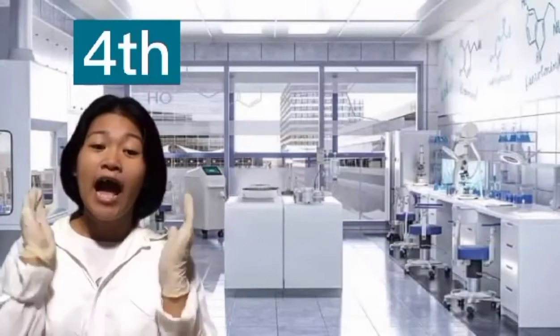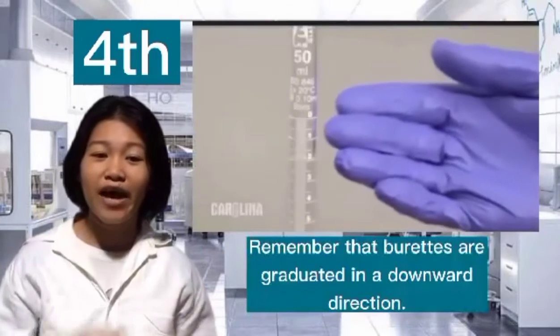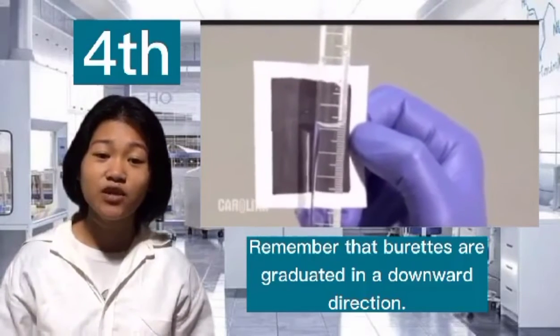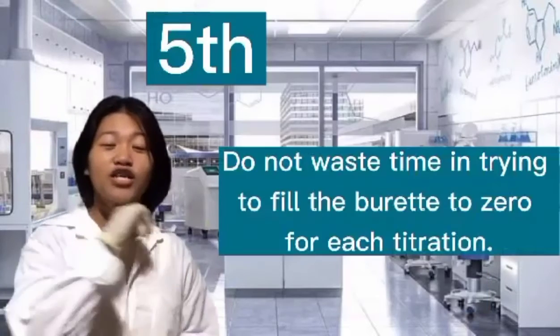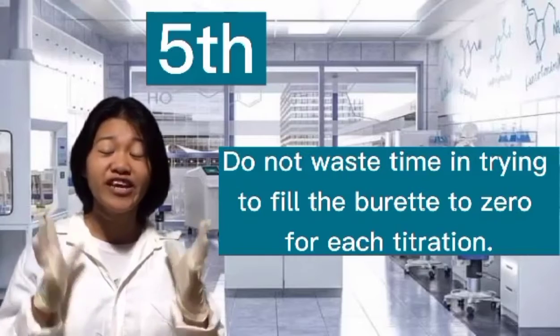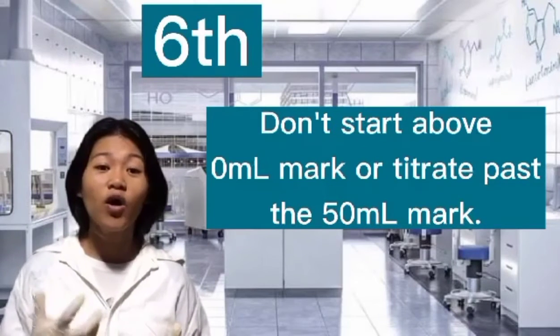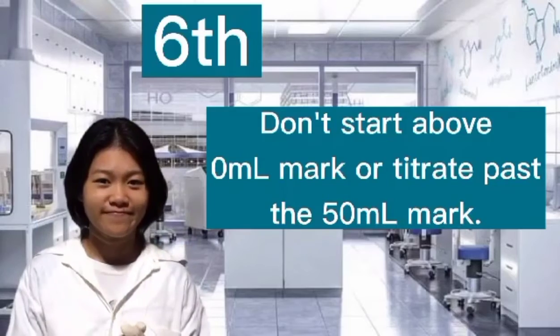Fourth, now that you are ready to read the initial volume, remember that burettes are graduated in a downward direction. The first estimated digit will probably be the hundredths place. Fifth, do not waste time trying to fill the burette to 0 for each titration. Sixth, do not start above the 0 mL mark or titrate past the 50 mL mark.